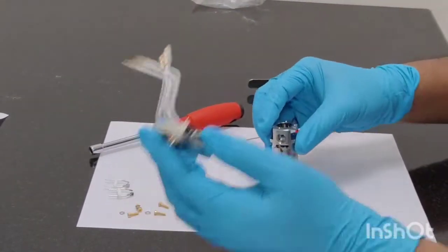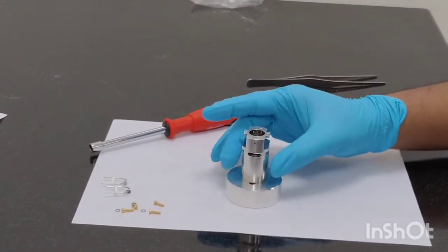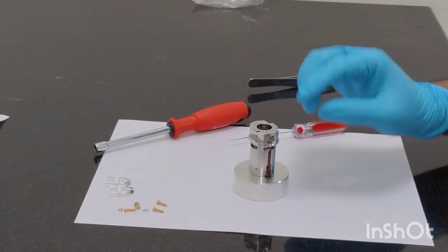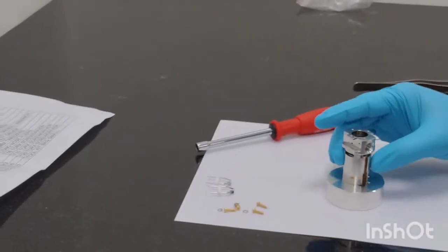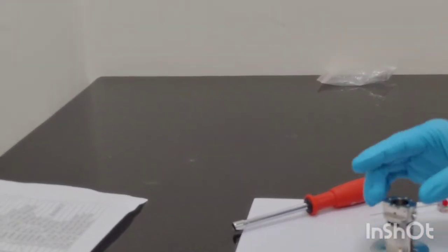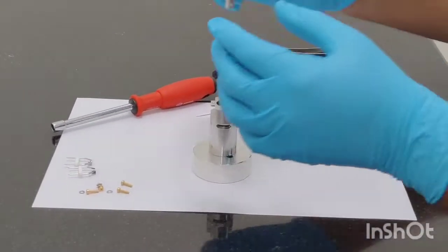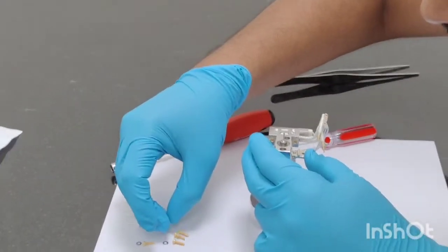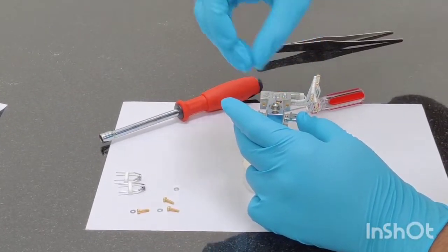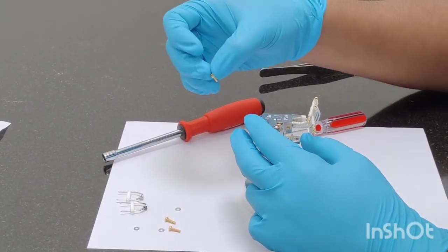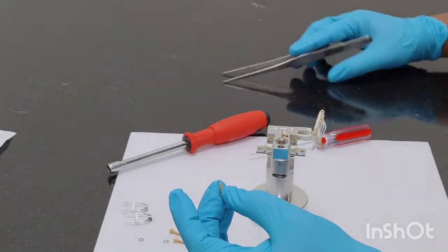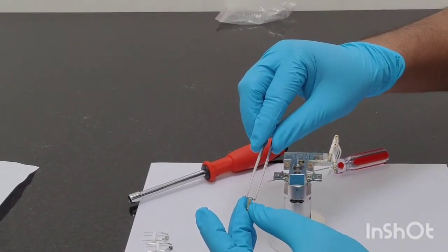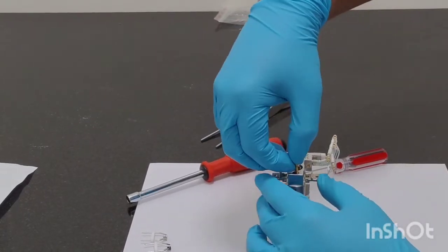Now you place this ion source body like this. This portion is going to face the right side, so that these portions which are there, this is your extended lens connector, these are your ion focus and entrance lens connections, they should be lying in the right hand side. And then we will be placing this heater like this. We will use two screws.